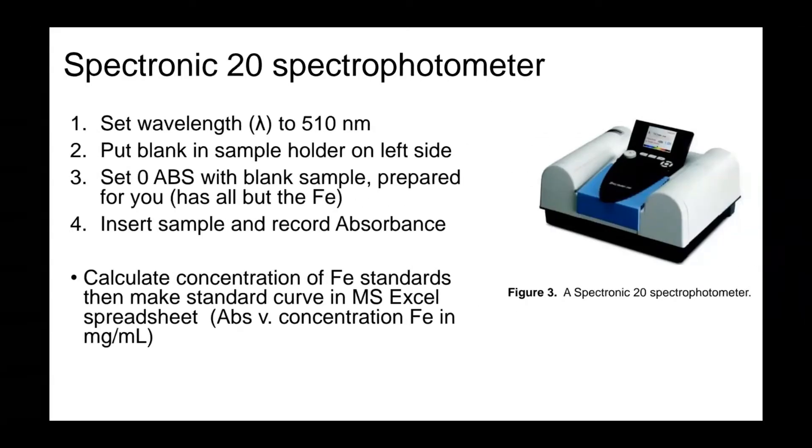When the standard iron solutions have been allowed to sit for the proper time, rinse one of the test tubes provided in the lab with distilled water. Before I show you, I want to introduce you to the spectrophotometer, which is the instrument we'll be using in the lab. In order to set up the spectrophotometer, you need to know your analytical wavelength. Then you put a blank in the sample holder on the left, set the absorbance to zero with the blank sample prepared for you. Then you insert the sample and record absorbance.